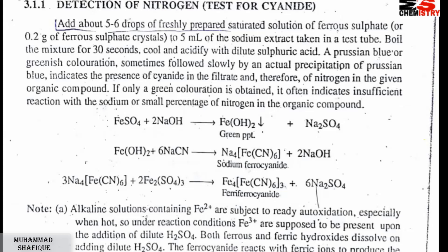We will prepare the test tube. This is why we use ferrous sulfate. In the test tube, we will take 5 ml of sodium extract. After that, we add 5 to 6 drops of ferrous sulfate. After that, we will heat and boil for some time — about 30 seconds. We will cool it, and after that, we will acidify it using dilute sulfuric acid.